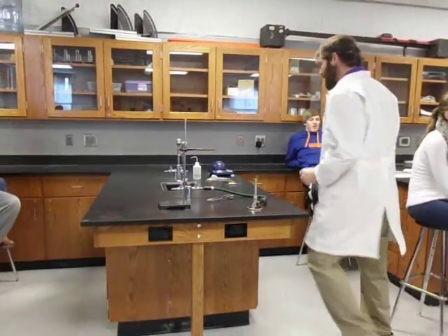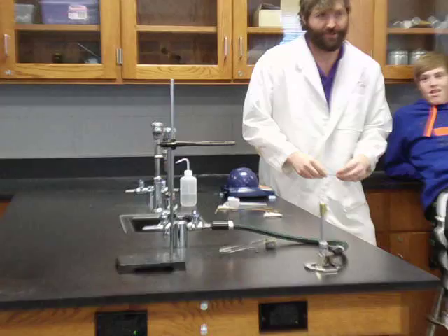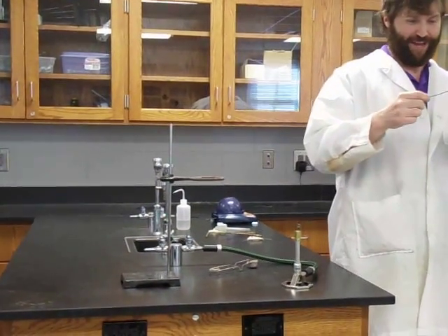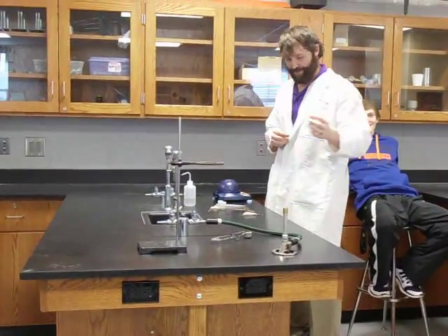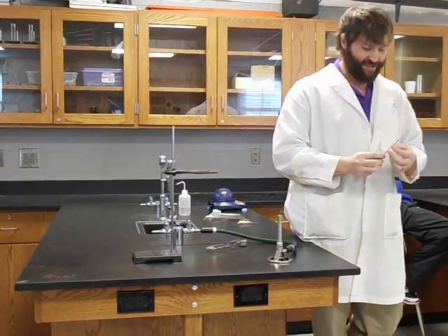Hey, welcome back. Today's lab is going to be about oxidizing a piece of magnesium.